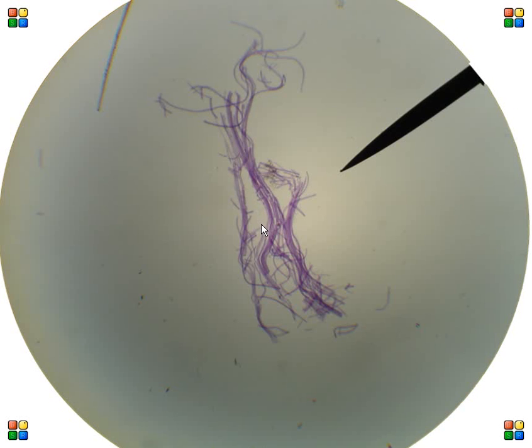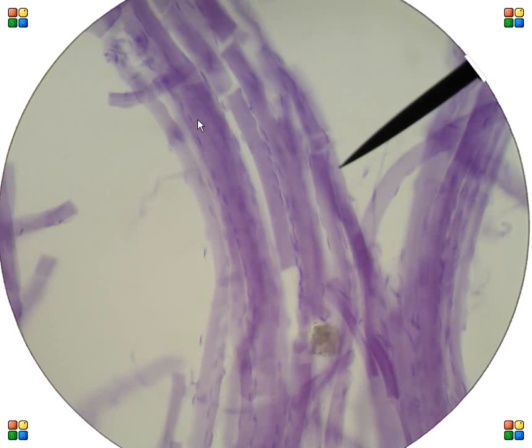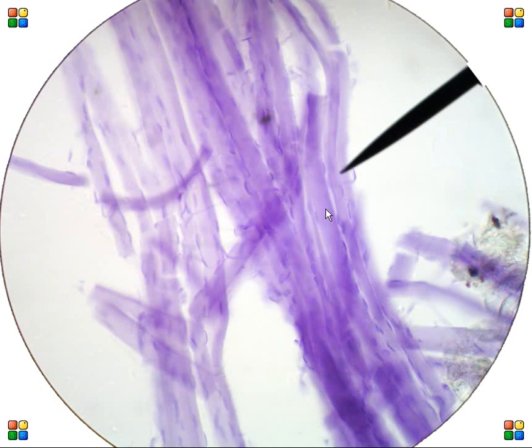Same type of slide from a different company. We can see the long tubes. The color is different but we can see those long tubes. We can see the multiple nuclei. And if we look close, we can kind of see the striations, although in this preparation it's harder to see. There's some striations there. I hope you can see them well.